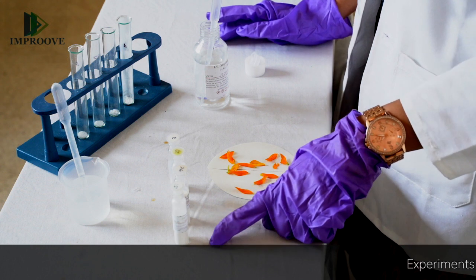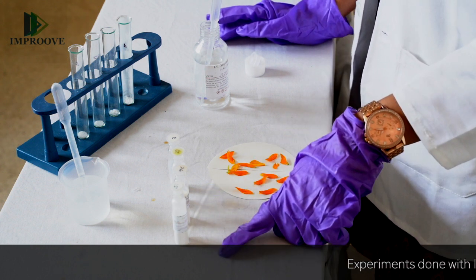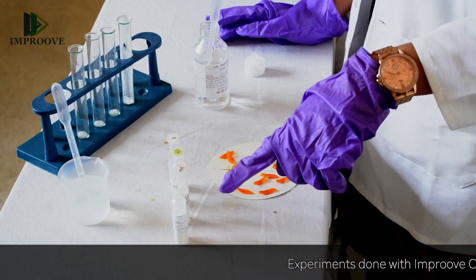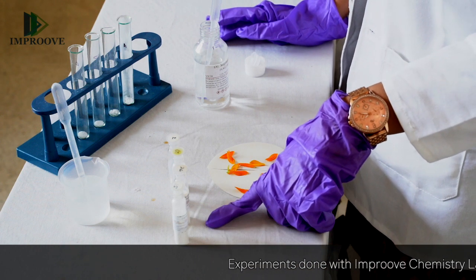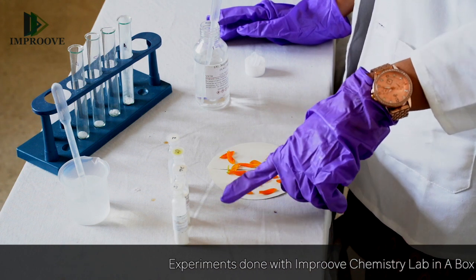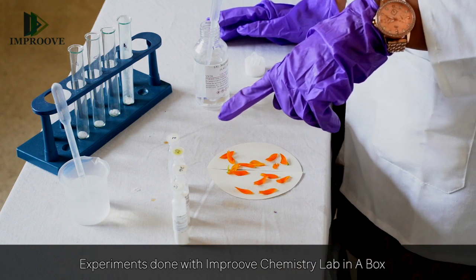In another one we will put ammonium chloride. In the third one we will put sodium chloride, and the fourth one we will put calcium chloride.